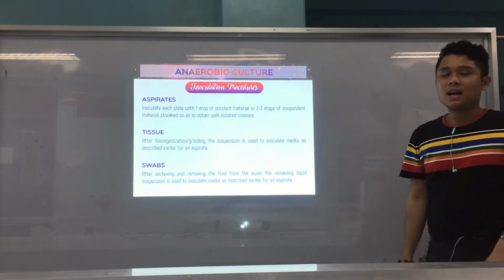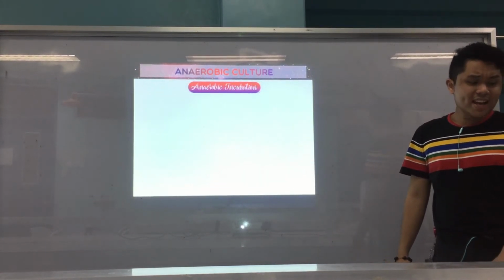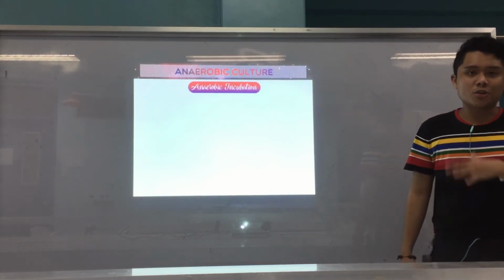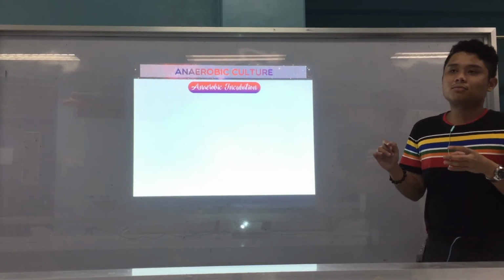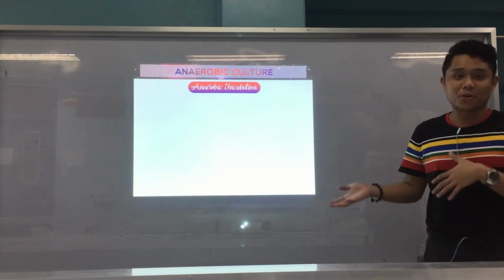Pareha sa aspirates, ang imong ibutang sa culture media. Alright? Okay. Now, next, after sa inoculation, we now go to incubation. So, how do we incubate your anaerobic culture? Generally, ang rule of thumb for anaerobic incubation is dapat wala dyan oxygen.